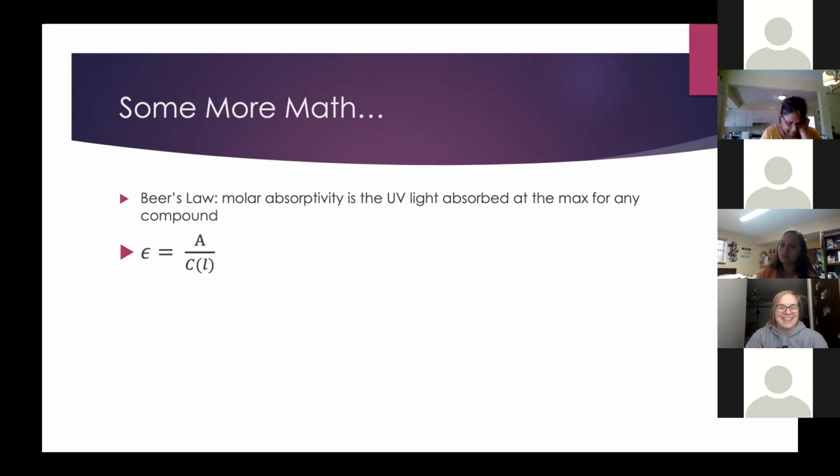Okay, and you got the max, and then you use the max to get the intensity of light for samples with different concentrations. Okay, but that was visible light. You have a solution that is colored, it's visible. But here, these solutions are colorless if it's in the UV region.